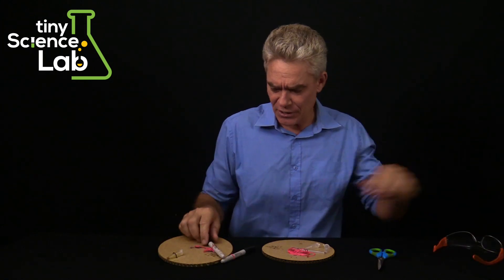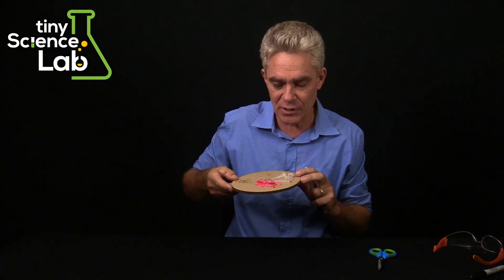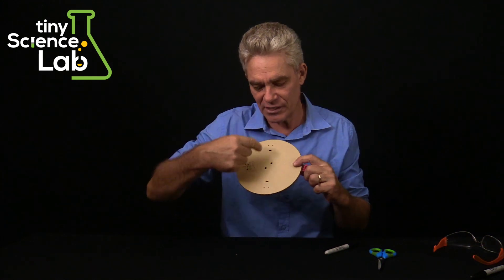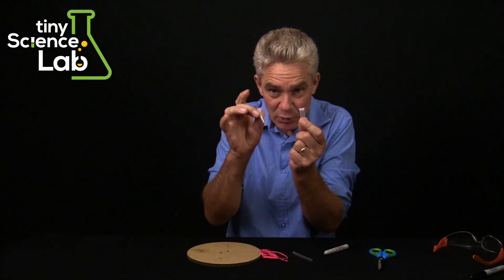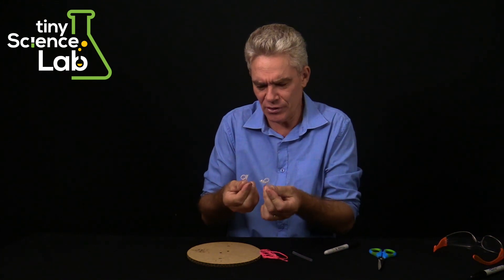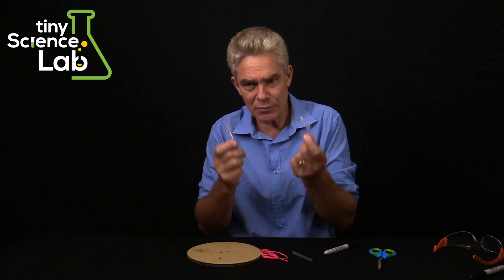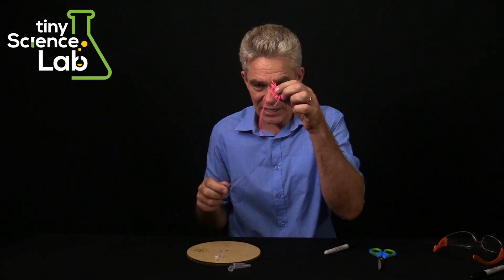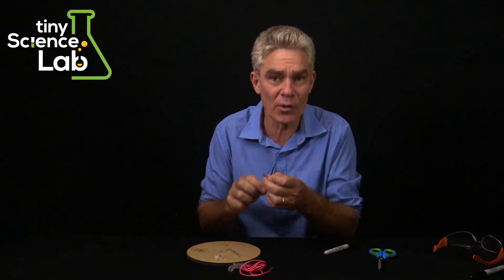So what are you going to need? You will obviously need the cardboard centrifuge kit that we supply. It comes with the cardboard round thing with all the necessary holes laser cut in it, and it comes with two little ampoule plastic bottles — little containers which are actually really good. The lids are really good and they hold two mil and they're calibrated. It also comes with a short piece of silicone tube, one meter length of string, and two little wire ties.